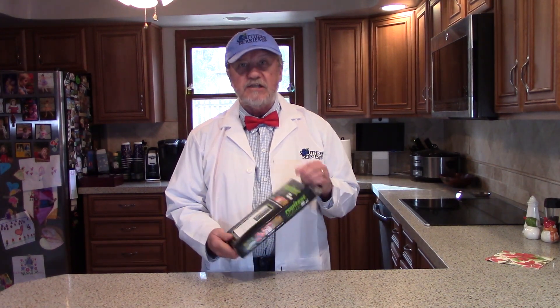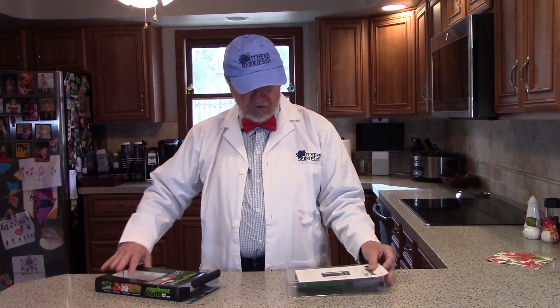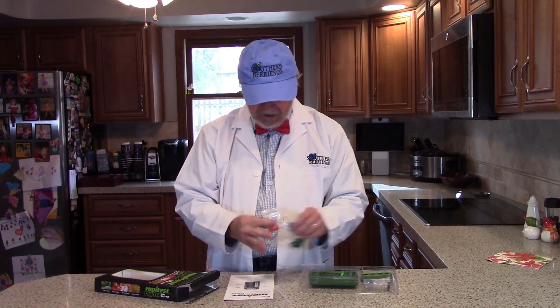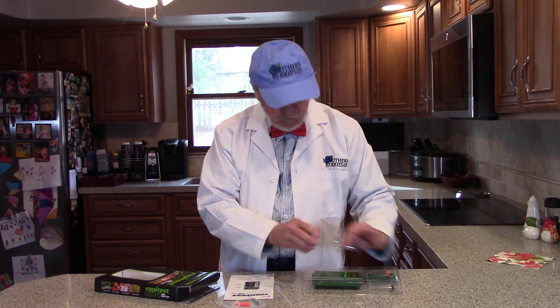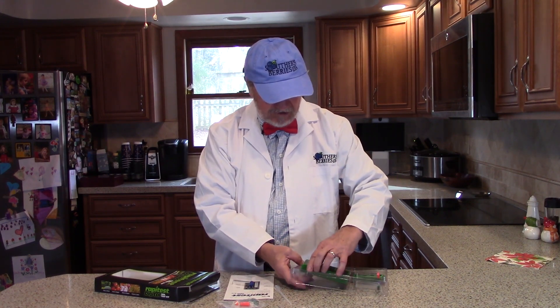To test our soil today, we're going to be using the RapidTest Digital Soil Test Kit. When you open this up, first thing you're going to notice is you have some instructions, so we're going to pay attention to those. We have a suction tube for putting the samples into the vials. We have our capsules that we'll use for testing the pH, the nitrogen, the phosphorus, and the potash. We have our test tubes that we'll put the samples in. And when we're finished, we have our soil tester that's going to tell us the results.